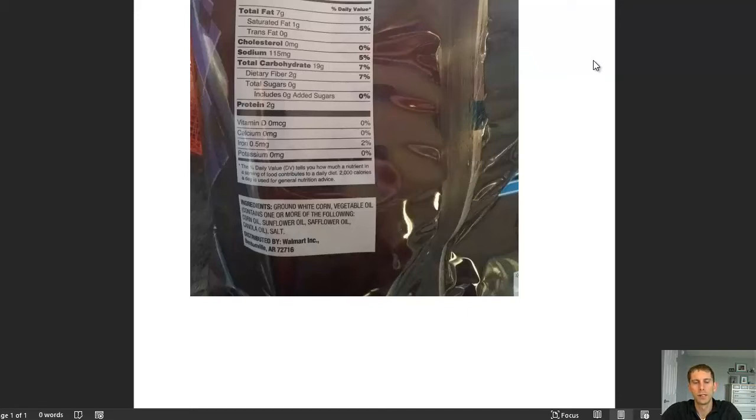Hello everyone, and welcome to the lipids extraction of fat experiment. In this experiment, we are extracting fat usually from a potato chip, but this is a special edition where we're extracting fat from corn chips this time.